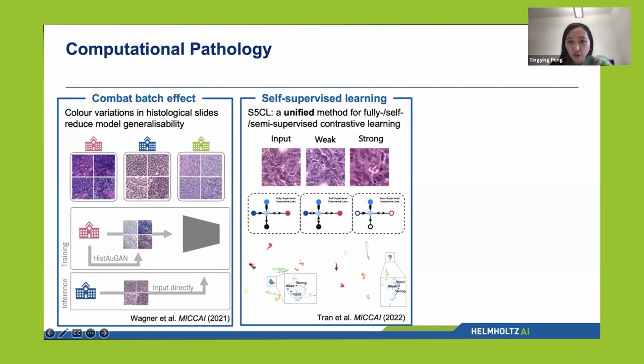Basically, we combine the supervised information and self-supervised information, and this can lower the requirement of annotation amount. Imagine before, if you had to annotate, I don't know, maybe 1,000 cells. Now we only need to annotate like 100, or even 20 or 50. So that can accelerate the model training quite a bit.